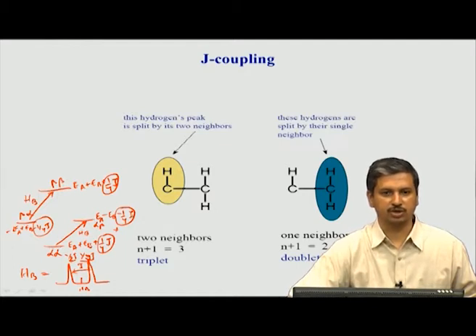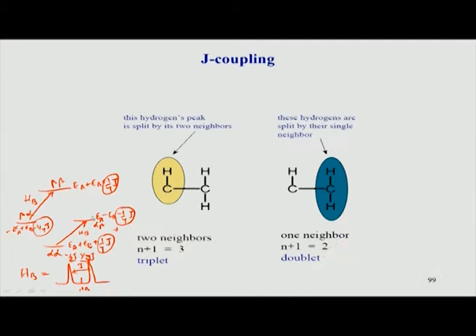It is coming because of this term here, that each of these terms adds some energy to the lower state and subtracts some energy from the upper state. So, these two energy levels have come closer by 1 by 2 J, and these two levels have gone further away by 1 by 2 J. Therefore, this is how we can explain that these two transitions, which earlier had the same energy, were one peak. Now, because of this addition of the J coupling value, it has got split into 2 different peaks.